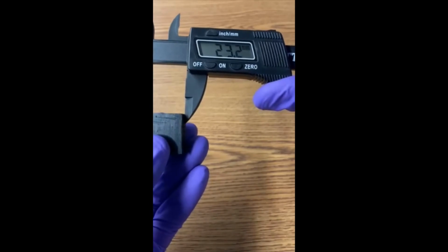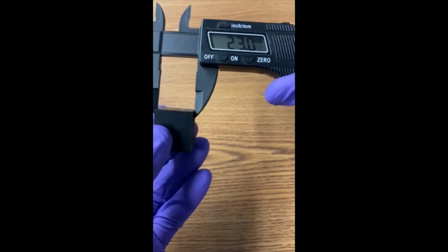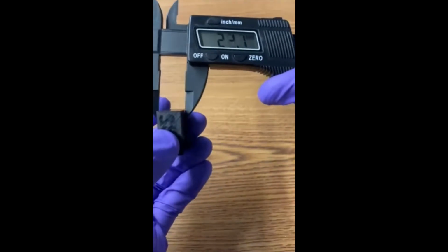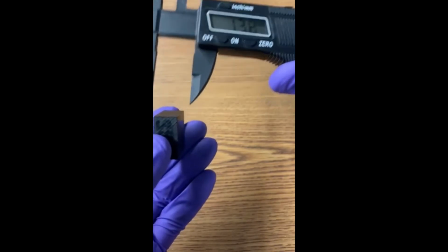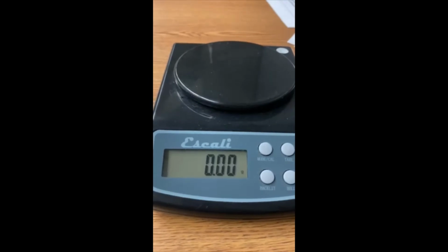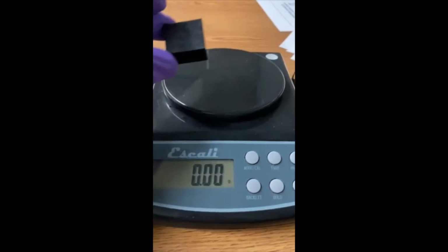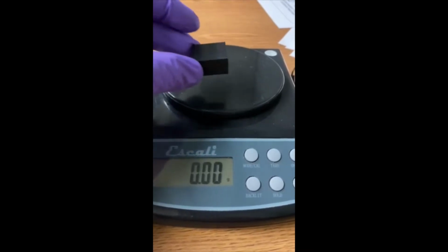Here we've made measurements of the length, width, and now thickness of the sample and recorded each of those numbers and used them to calculate the volume of the sample. Next, we take the sample block and put it on our balance and measure the mass of the sample. In this first example, the mass is 8.4 grams. At the end of this video, we have repeated this process for each of the other polymer samples.